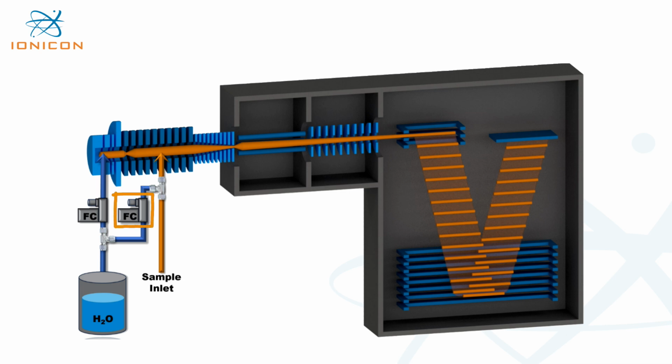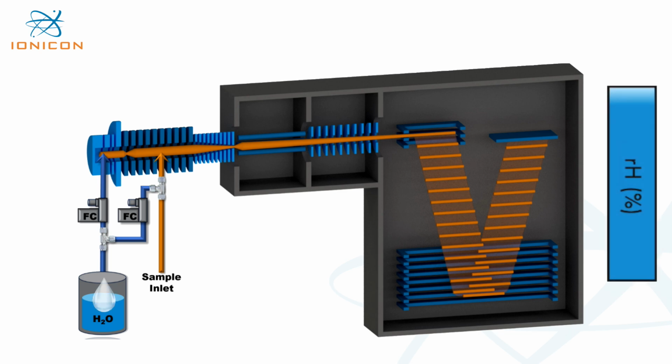Consequently, the two T-pieces are connected via another mass flow controller. Via monitoring the H2O-H3O+ cluster percentage to get information on the current humidity in the reaction region and a PID module in the instrument's control software, a target humidity can be chosen and the water vapor flow can be automatically adjusted.